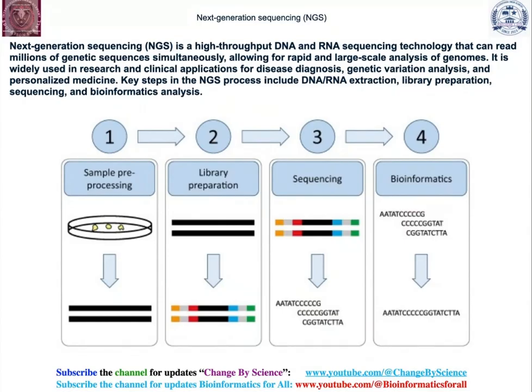And the last part is computational or bioinformatics analysis, which mostly is carried out by the laboratory member itself, but sometimes the sequencing service providers also support up to basic analysis of the data set. But if you want precise and minute analysis, then you need to be aware of bioinformatics analysis and approaches so that you can fulfill the major goal of your project design.